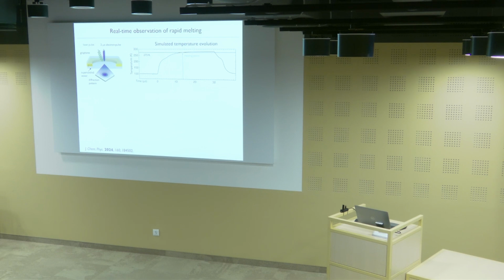And now what we do is we record diffraction patterns as a function of time. This is what the diffraction pattern looks like before the laser pulse hit the sample, so before time 0.